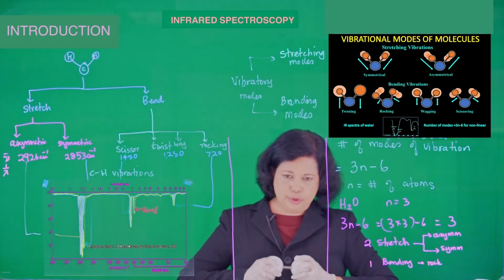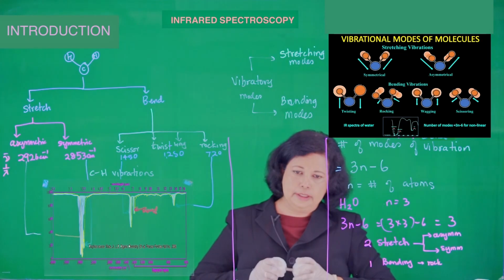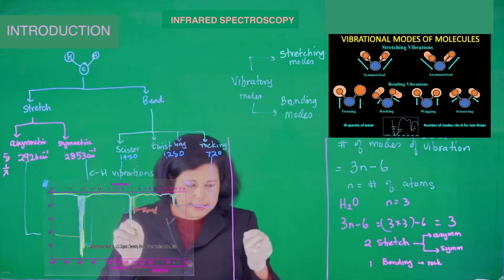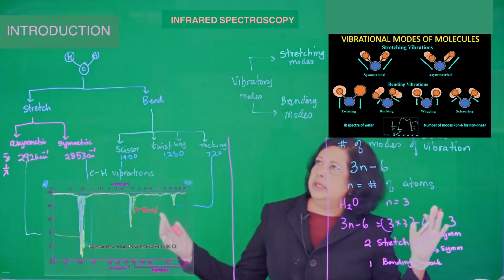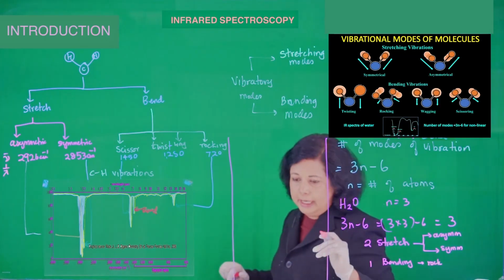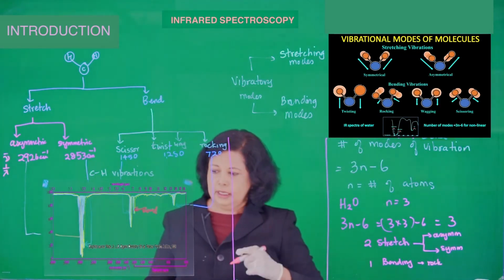And see the stretch and expand, okay? It's contract and expand, just like a spring can do that. A bond can do that too. It's elastic. How do we know that this is all really true and we're not kind of making it all up or imagining stuff? We can actually calculate these values.